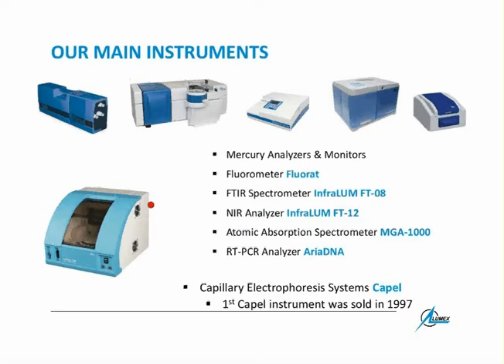There are certain buffer additives which cover the inner surface of the capillary, so as to avoid any sorption of your substances to the capillary wall. If you use such additives, as we do in many of our recommended buffers, we have the reproducibility of migration times on a very high level, within 1 to 2% RSD, which is really excellent.